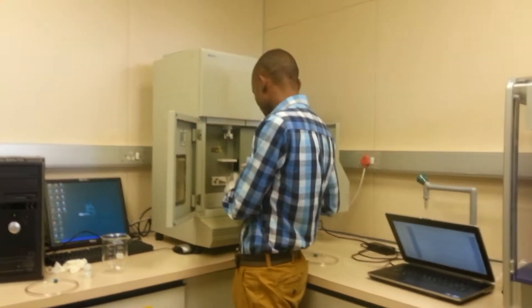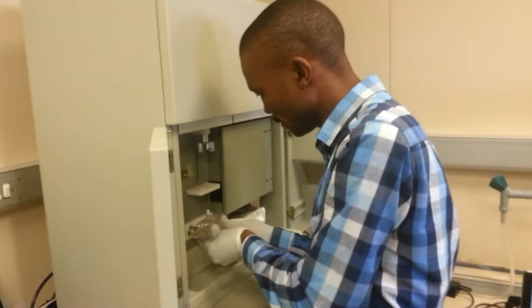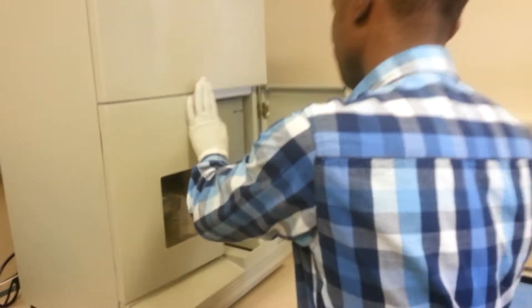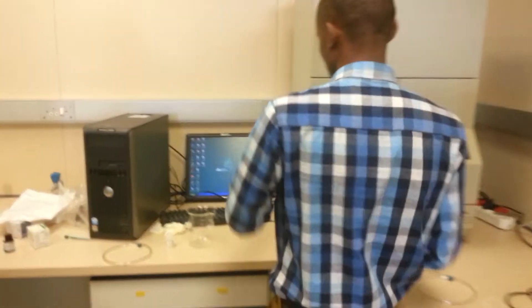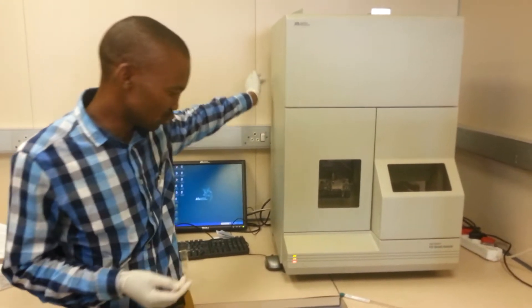I'll just start now with a sequence of putting up the instrument. You must have turned this right here. So to switch on the instrument, just there's a button here at the back. That's where you switch it on.